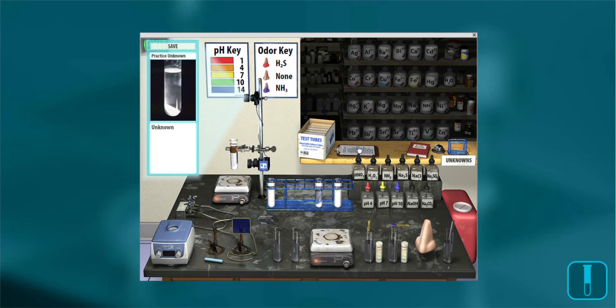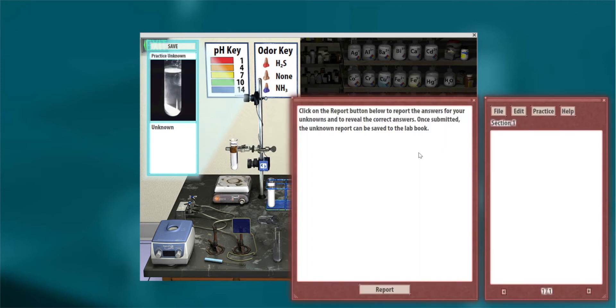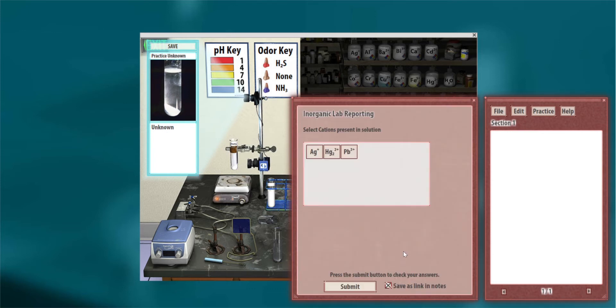They can enter their lab book and report what they think they have. Say they guess lead and silver and submit. They get one green box, but the other boxes weren't correct, so they need to go back into the lab and test that unknown again.